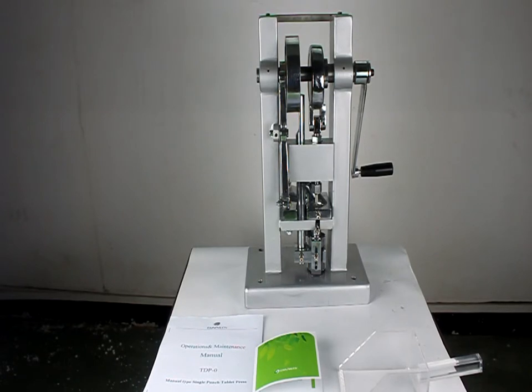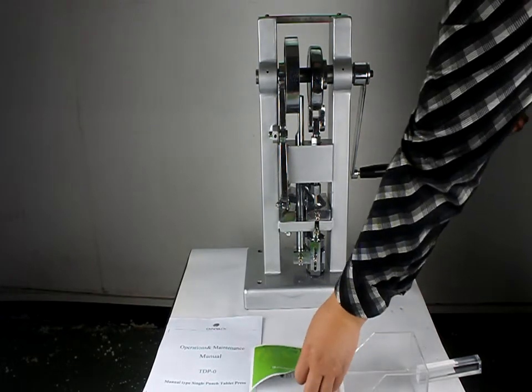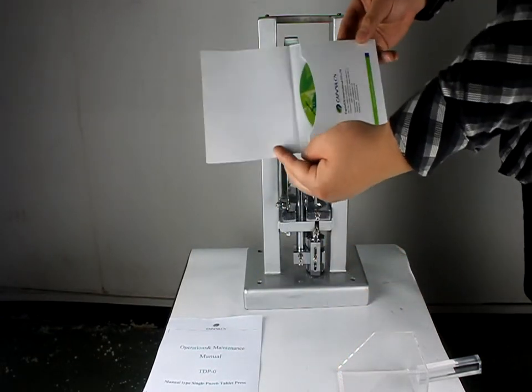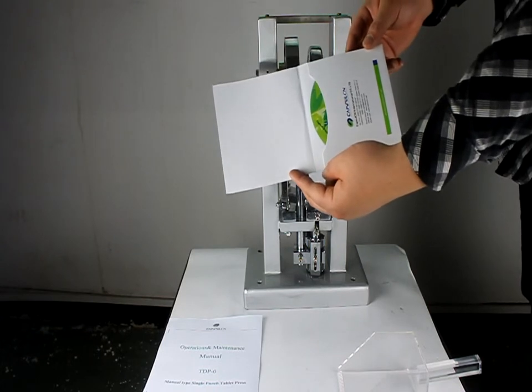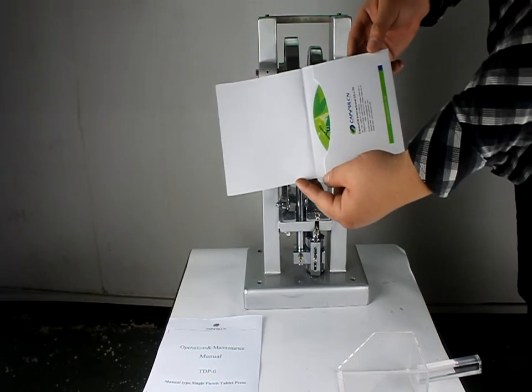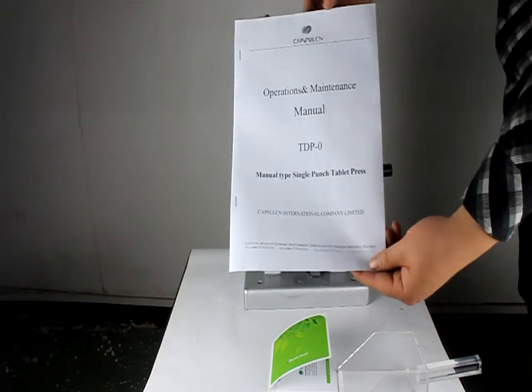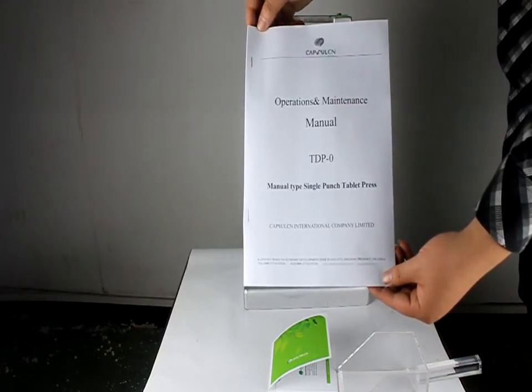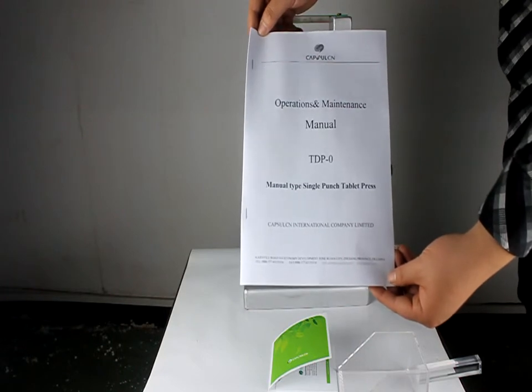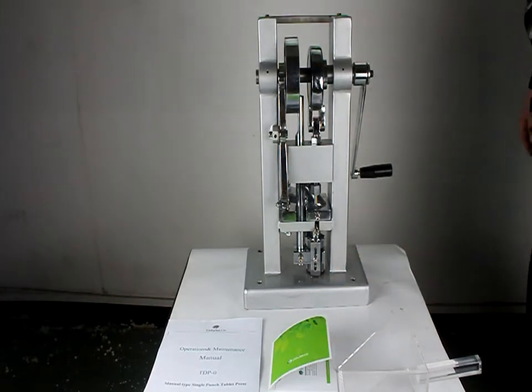This is a manual tablet press machine from CapsuleCN. Today we are going to show you how to run the machine. When you purchase the machine, we will offer you a video disc that you can look at, and we also have a paper user manual to show you how to install the machine. Now we are going to show you how to make the tablets.